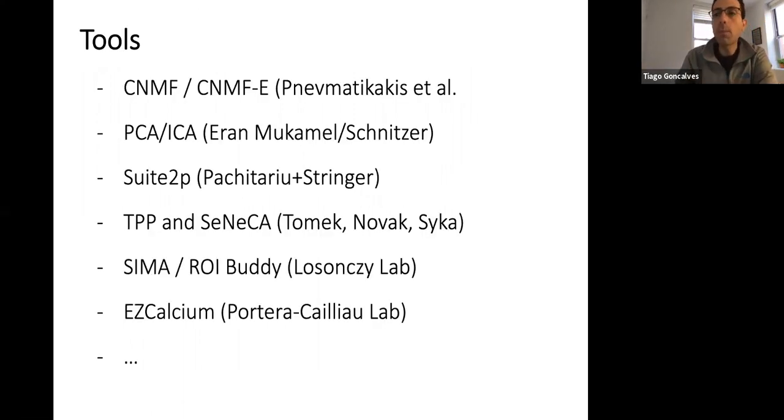Now, there are a bunch of different tools out there, and I wanted to spend a little time talking about a few of them. These tools are meant to make your life easier. Right now, the days when you would develop your own analysis pipeline are mostly gone, because it has just become so complex. And there are people out there who only do this. Their whole careers are built around analyzing calcium traces, and they do it really well. They dedicate their entire time to developing these computational tools. One example of that is CNMF. We're going to talk a little bit about what CNMF means and what it does.